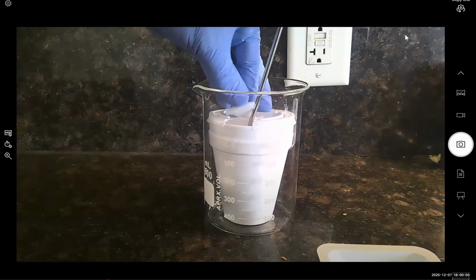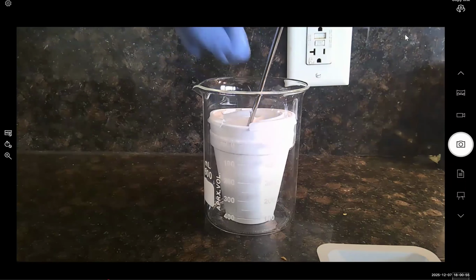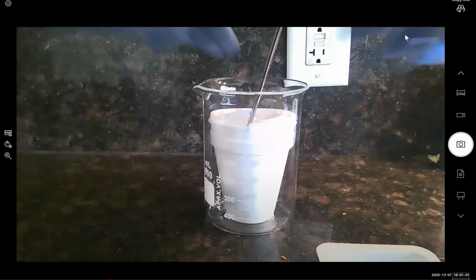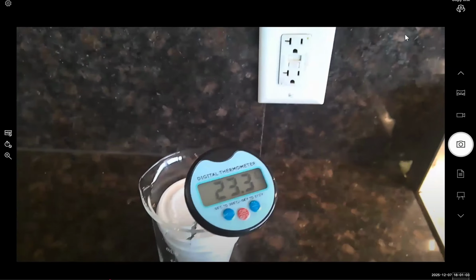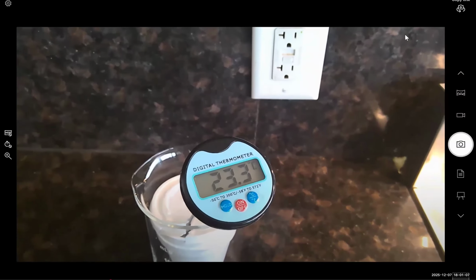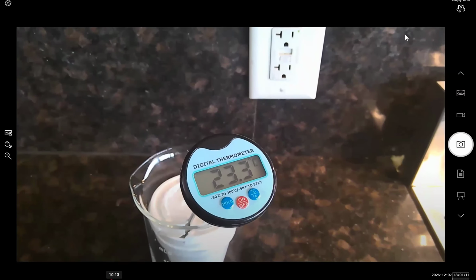We're then going to cap the coffee cup calorimeter and we're going to stir it and monitor the temperature over time. So the heated metal piece is transferring heat into the water in the calorimeter. And as we can already see, the temperature is starting to increase. So we see it's at 23.3 Celsius now.